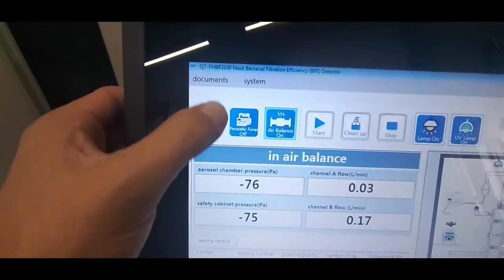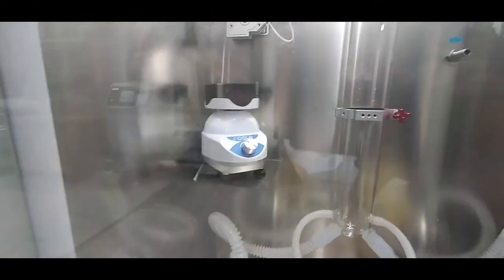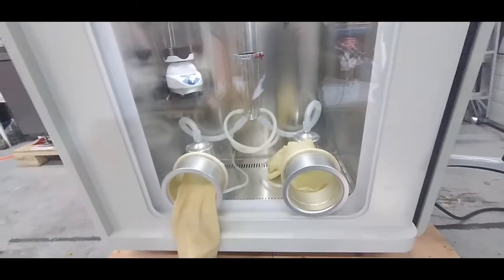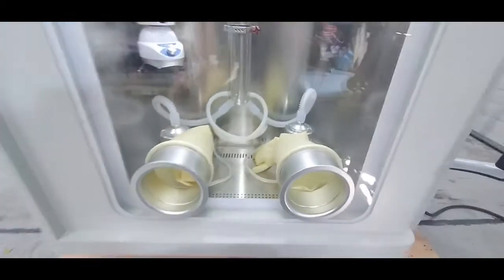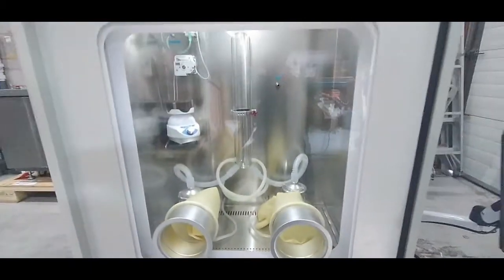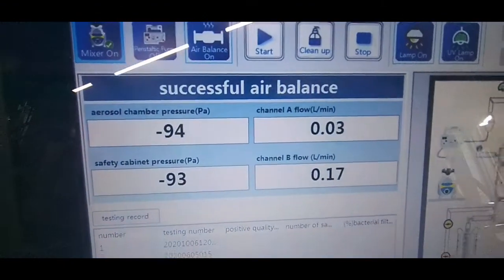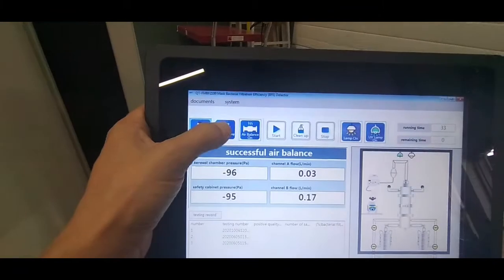The mixer gets turned on here, and we can see that the negative pressure is starting to build. The peristaltic pump is also spinning.